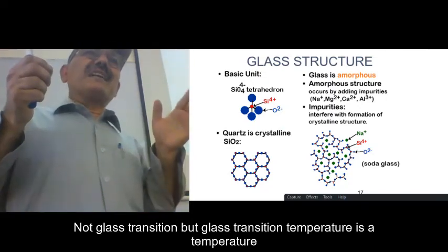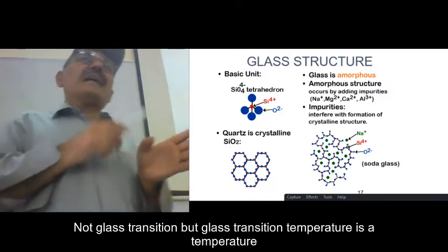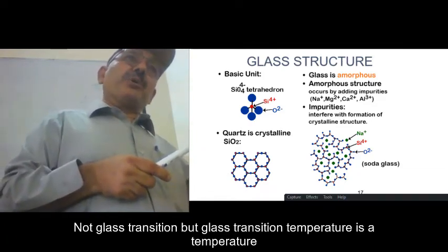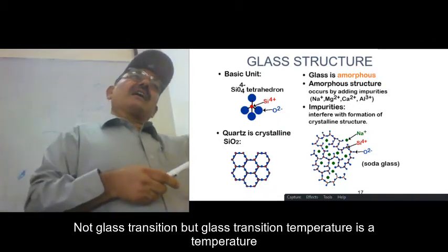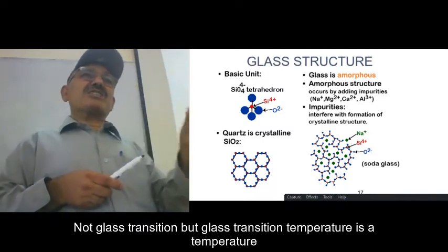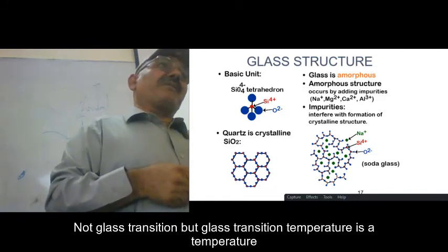Now, as a beginner in research, the first thing you do, I told you, take the raw materials as a material scientist and heat them up, preheating, which I told you: oxides at 800, carbonates at 180. Exactly measure the weights, the stoichiometric weights you need for the final phase.